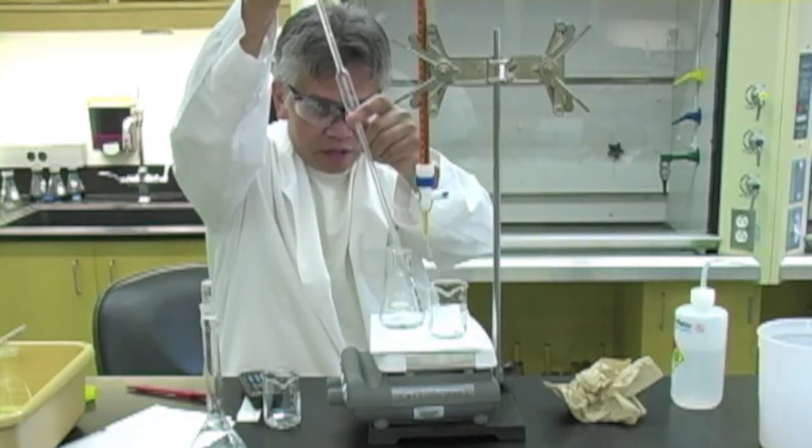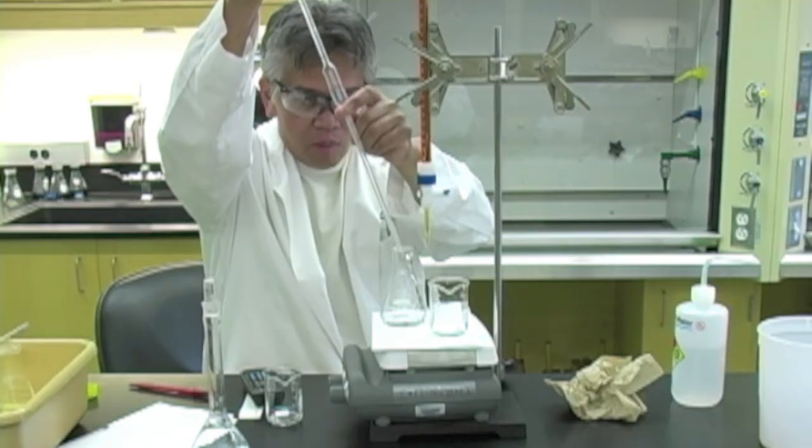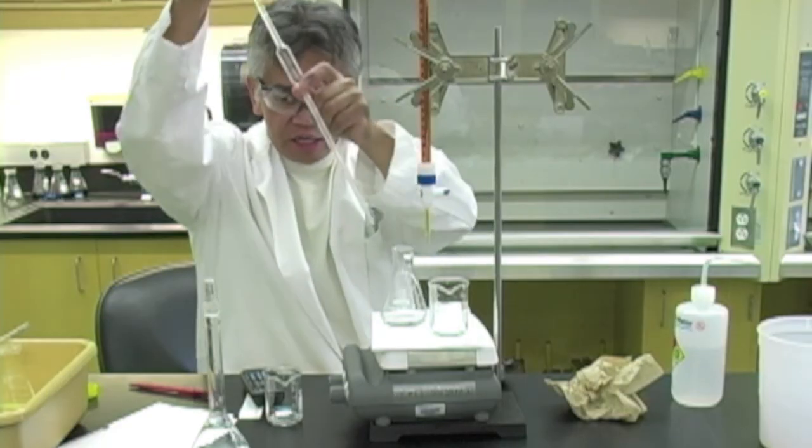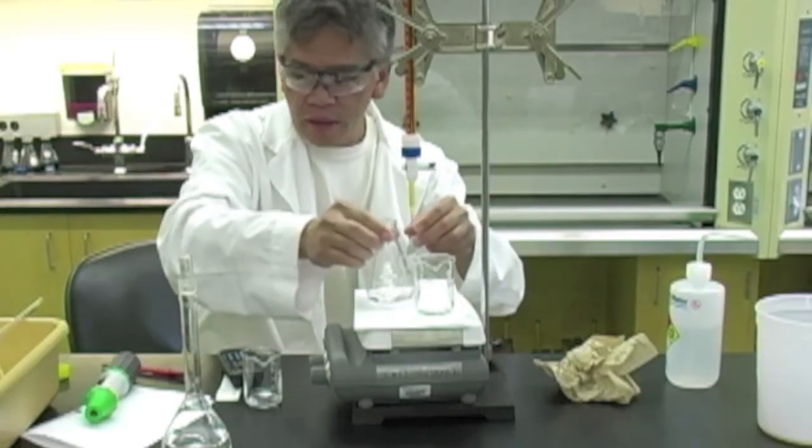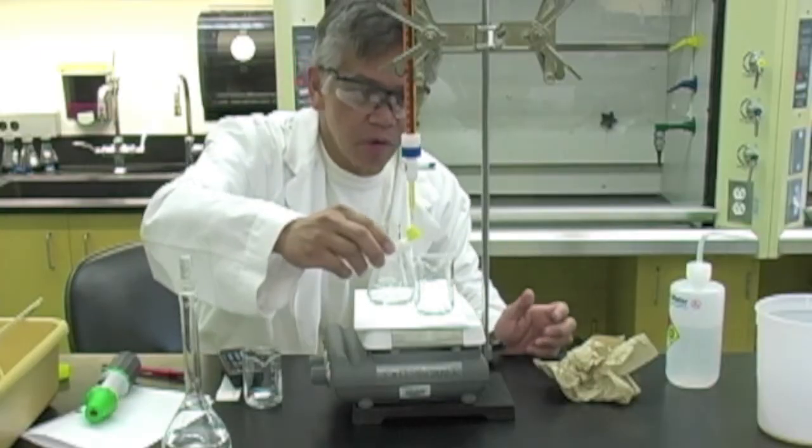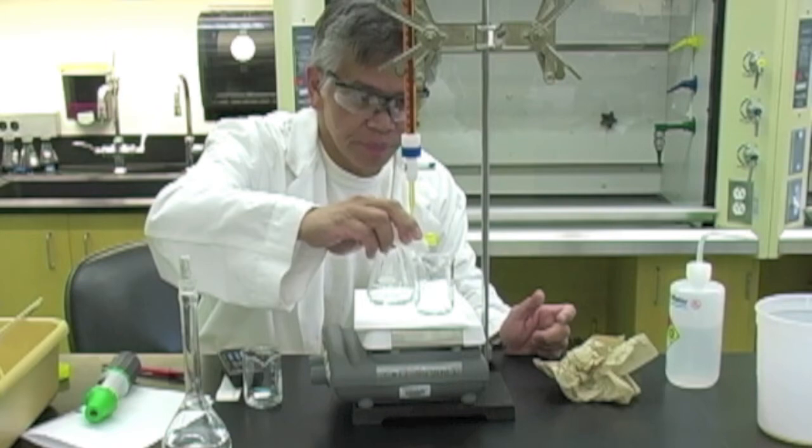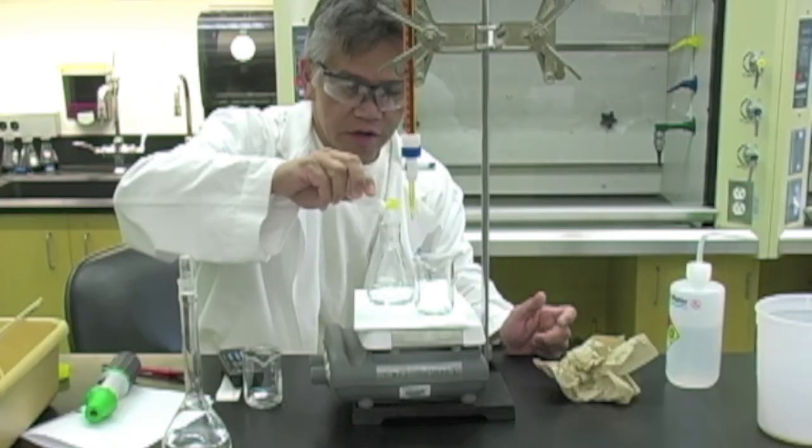Recall that these are calibrated to deliver. So you just want to make sure that all the volume drains and touch the inside of your Erlenmeyer flask. Don't forget to add your starch indicator, otherwise you will never see the endpoint. I'm going to add 10 drops of starch indicator to my unknown.